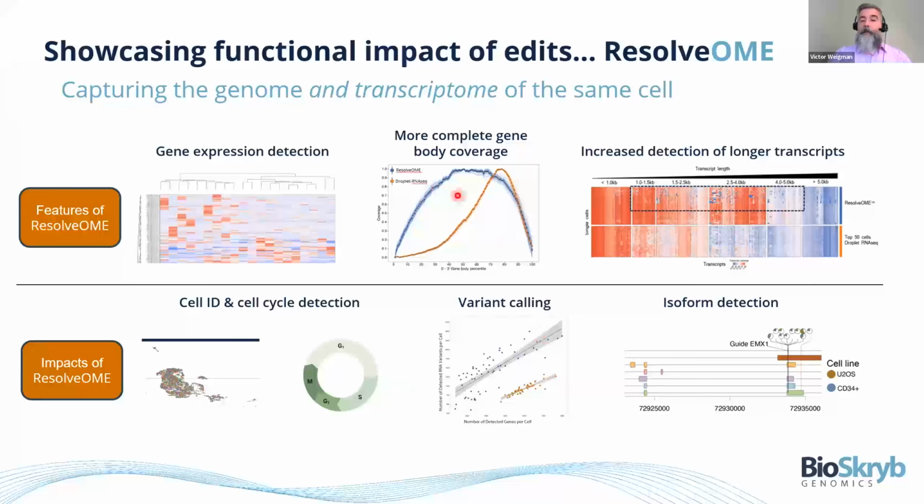We could do variant calling, again, a larger gene body, differential isoforms, longer isoforms. We could do a lot more variant calling on a given transcript and across the transcriptome than, again, a standard droplet-based sequencing. And I talked already about isoform detection. Blending these two together, allele-specific expression certainly is part and parcel to having a genetic event that leads to a transcriptomic event where you're shifting expression of not just an isoform, but a given allele in that isoform, which has the most potential to have real protein change.